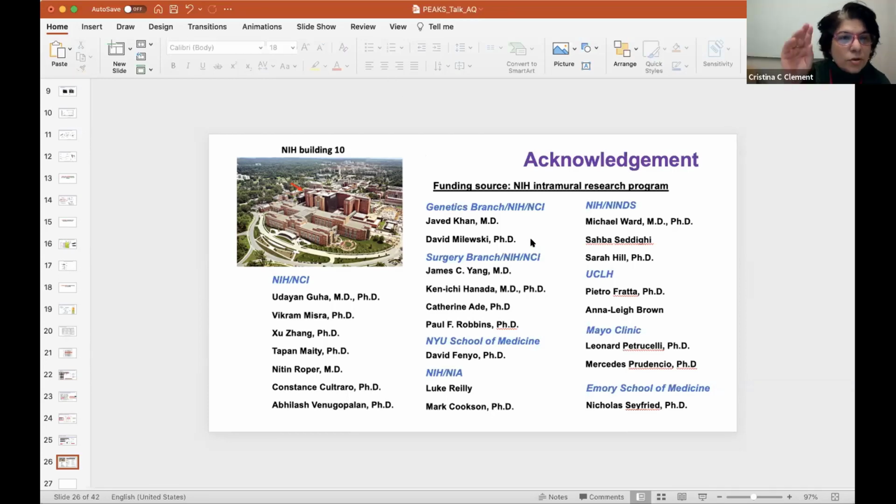I have a related question. Great talk. Thank you, Andy. If you really want to validate, like Dr. Tony Purcell said, this PTM on the peptides and their immunogenicity, I know that there are companies which can synthesize phosphopeptides, if you are really sure about the site and how well it is identified.